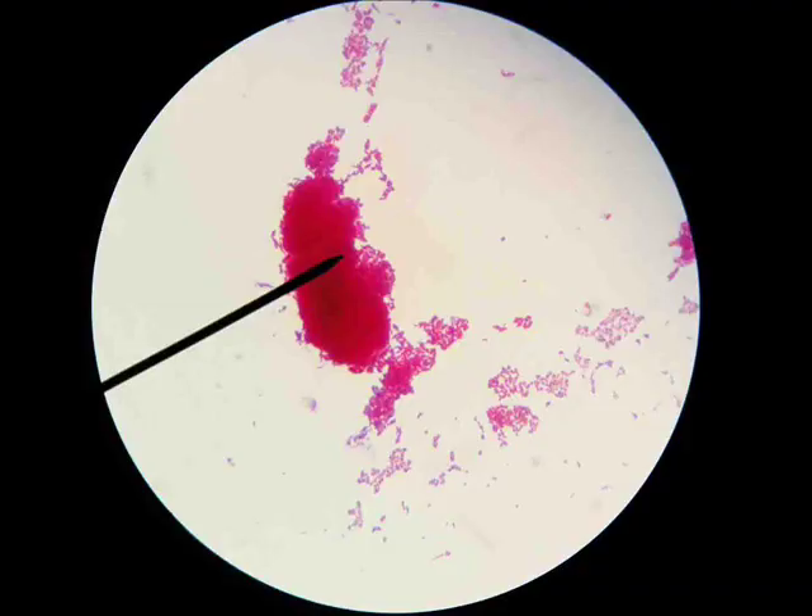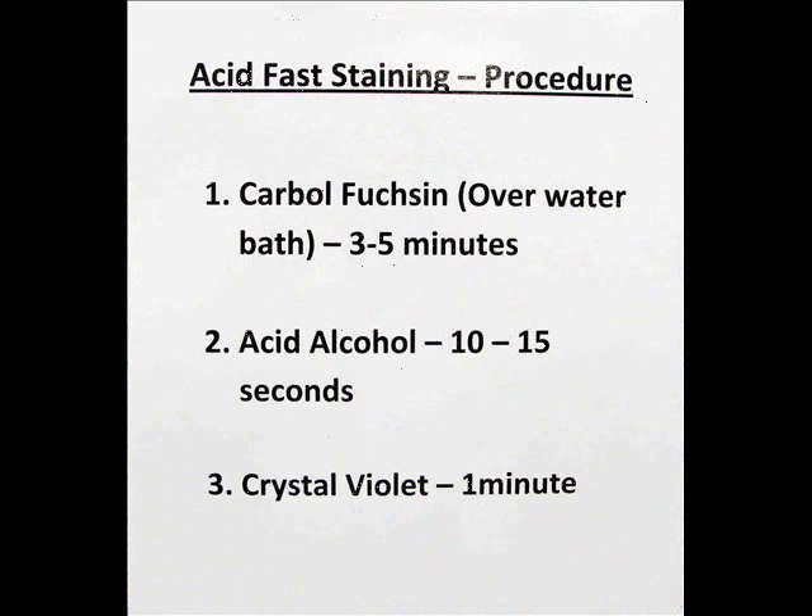After staining, this is what our acid fast cells will look like under the microscope — hot pink — and they often stick together because they're waxy. The second step will be the decolorizer, acid alcohol, which will run down the slide for 10 to 15 seconds. After rinsing, we'll then apply crystal violet, the counter stain. This will impart color to the non-acid fast or non-waxy cells, and our non-acid fast cells will be purple when we're done.